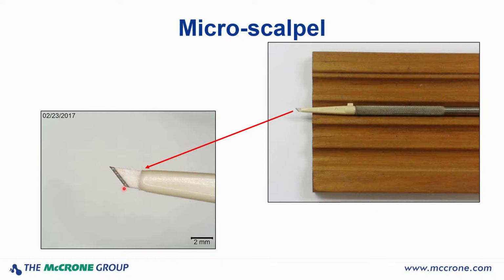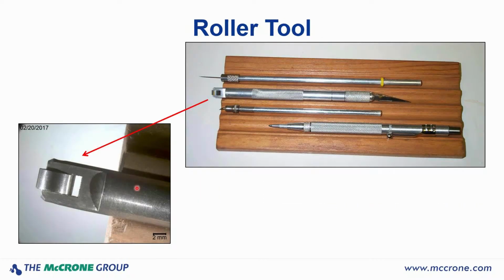I happen to like the 45 myself. You can also get them with shaft length differences. This is the smallest one we can get, and that's this dimension right here. If you get it much longer, you might be able to access some particles more easily, but the scalpel blade is going to break much more easily. So I like to get the shortest one that I can find. You'll see me using that later.